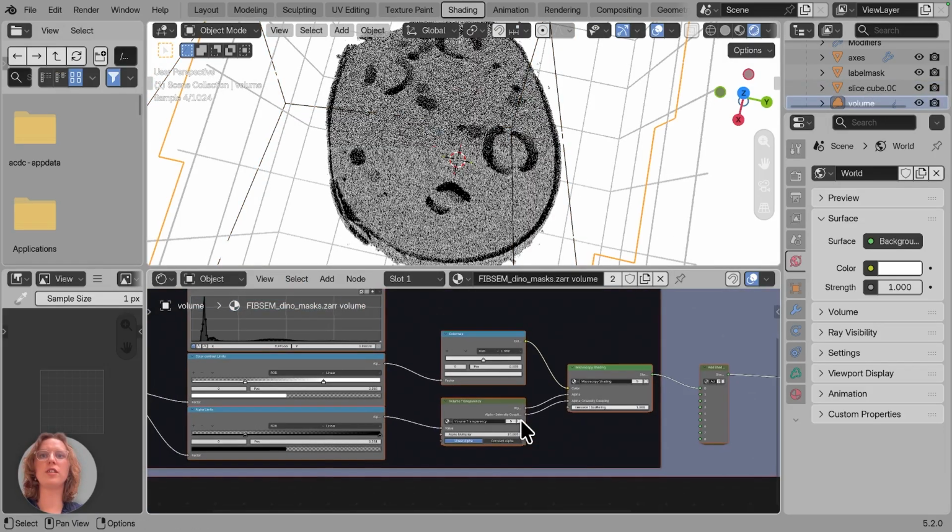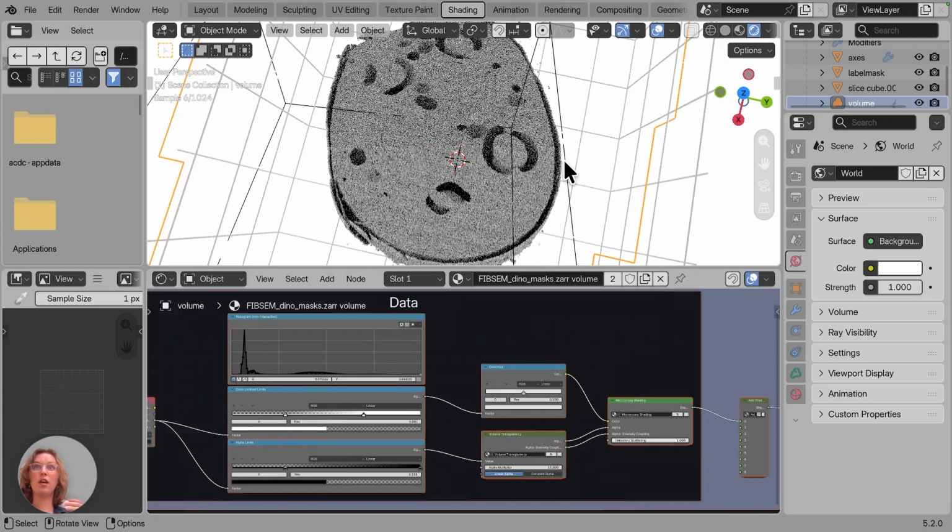And here we start to see why I really like EM data, FIB-SEM data, in Blender: we can see cavities like this way nicer in something like Blender than in a lot of other software, because we can actually do a full scattering ray traced render.